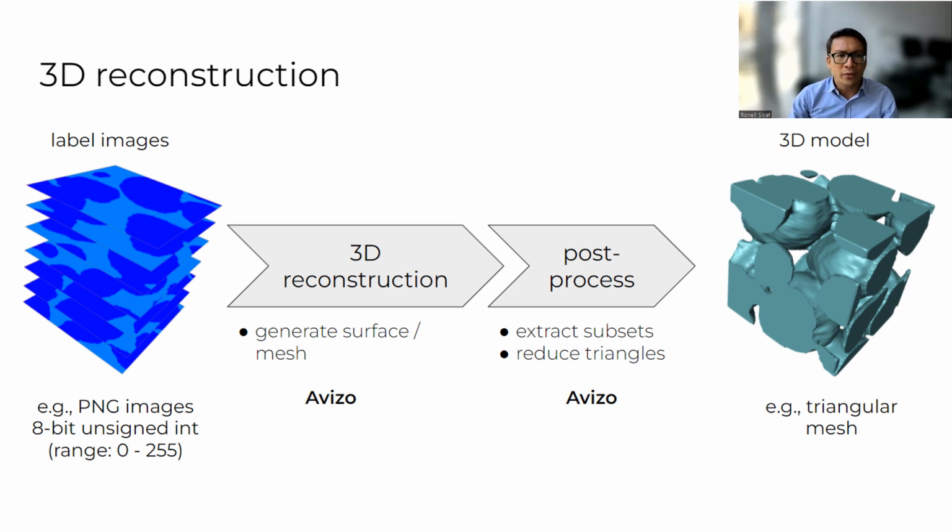So this next part is very helpful just in case you don't have access to the Avizo plus VR option, or if you want to build kind of a different experience for your data set. So I'll go ahead and play the video. And as usual, if you have questions, just post them in the chat.